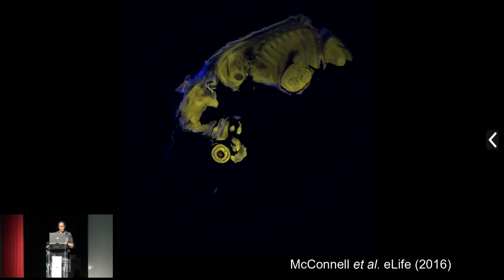Coming back to our 3-dimensional imaging though, because that's really where it all started. These are some of the first images that we took and subsequently published. So this is a 12.5-day-old mouse embryo. It's been fixed, stained and cleared. The stains here are acridine orange, shown as the cell nuclei. The blue is a neuronal variant of beta tubulin, so this is an antibody labelled specimen.